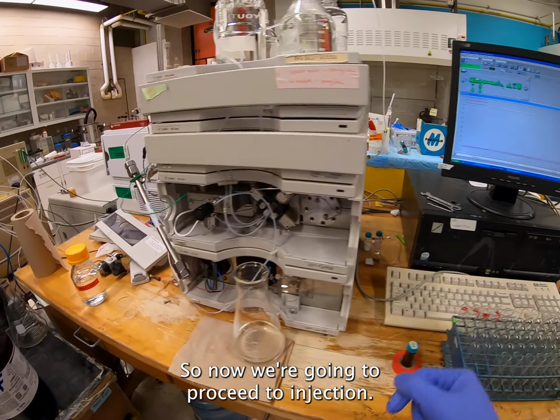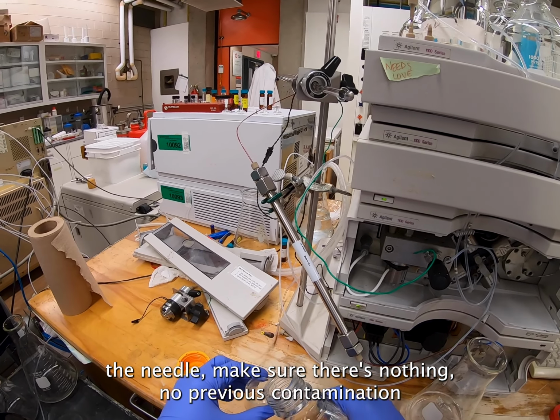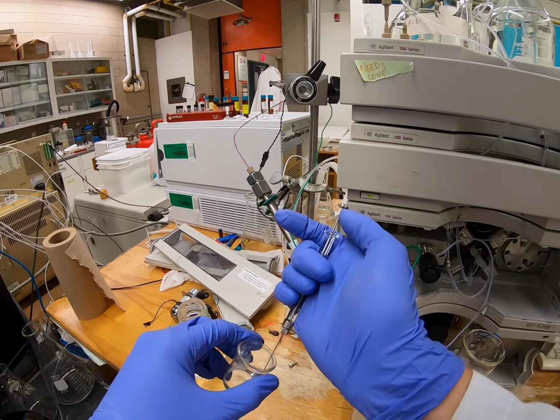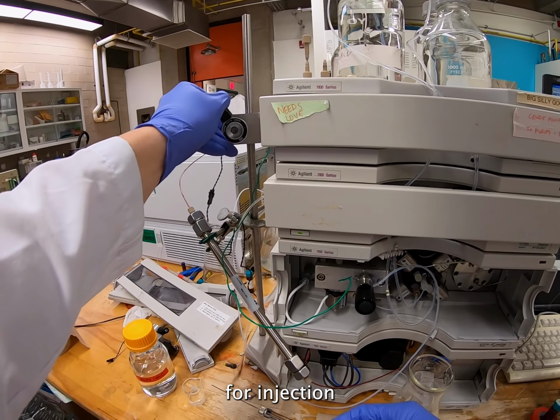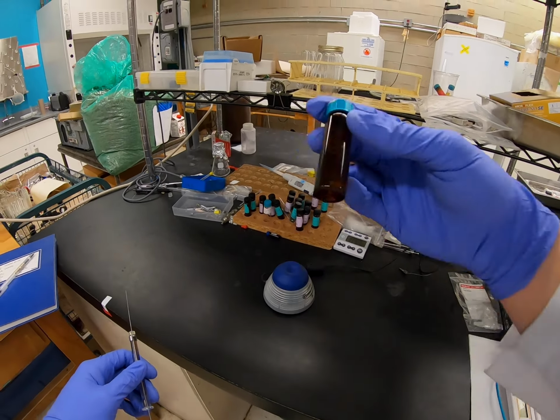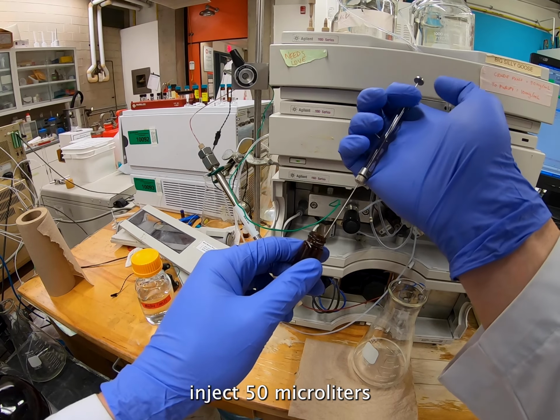So now we're going to proceed to injection. First, you got to clean out the needle with methanol and make sure there's no previous contamination. Then we want to prep the column for injection and re-vortex our sample. Then we wanna inject 50 microliters.